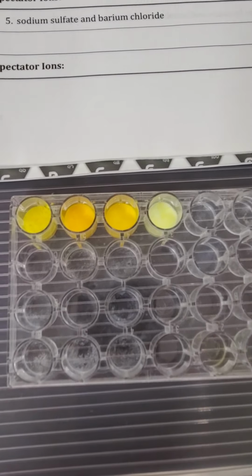And lastly, for this page, we need a sodium sulfate. And barium chloride. We get a white there. So take a few minutes to record your observations. Don't forget the busy work, and don't forget to balance equations. We didn't do that, and I didn't do that on purpose. So don't forget to balance, and we're going to flip over to the next page.